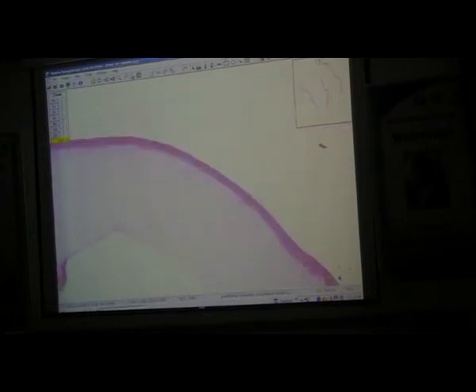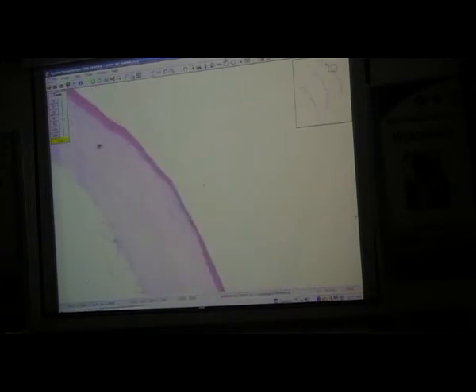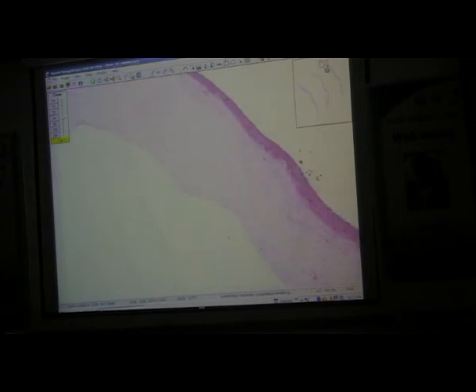The reason that the clefts are gone is that the cornea here in the periphery is extremely edematous. And by the way, just to prove to you that this is not something focal, I will take it to the other side, and I will show to you that even on the other side, there we go. The cornea is still edematous. You see? No clefts. No clefts. So what is the reason that the periphery of many corneas that we see in the lab look edematous peripherally? Any ideas?